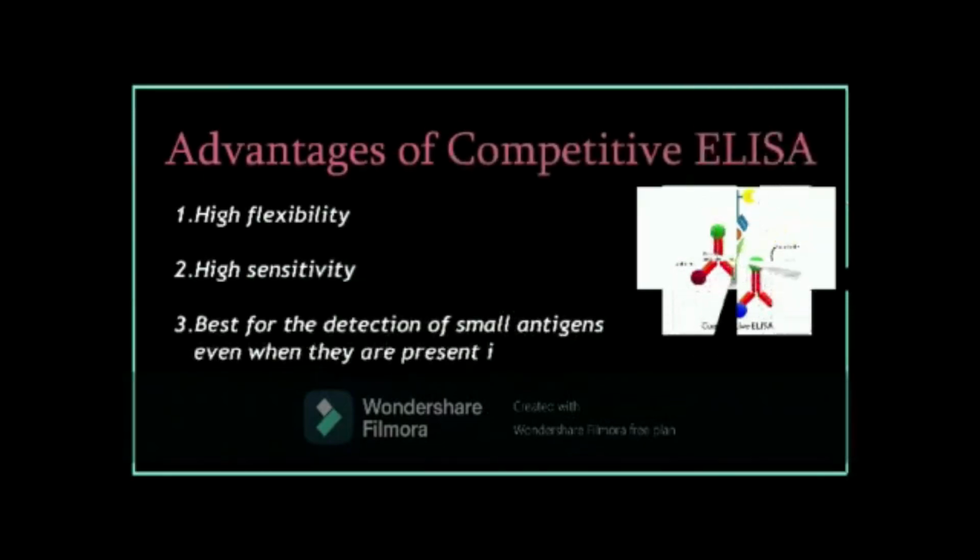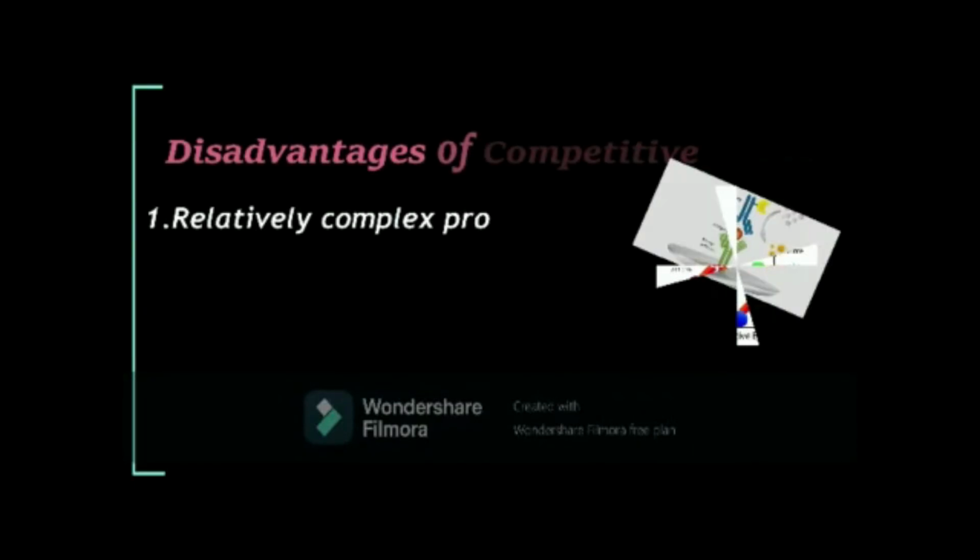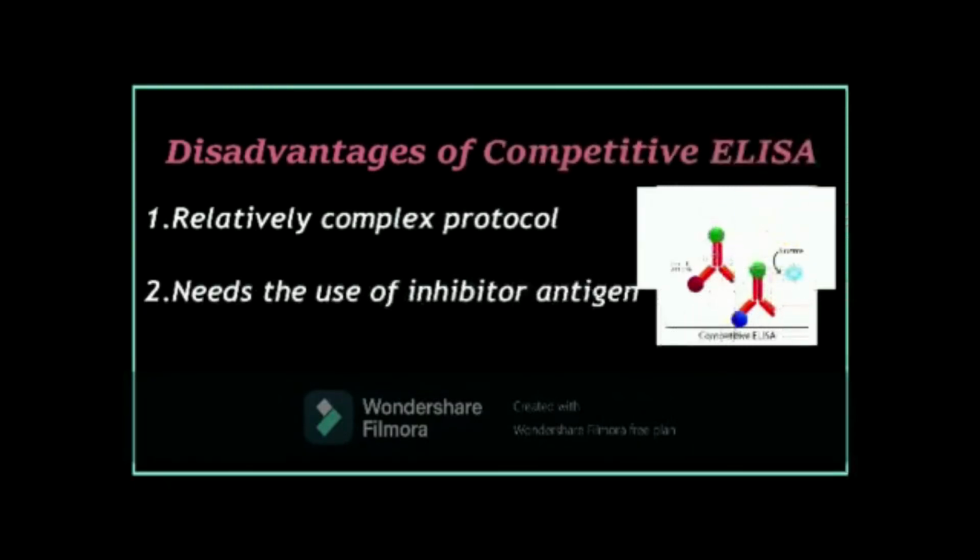Advantages of competitive ELISA: high flexibility, high sensitivity, best for detection of small antigens even when they are present in very low concentrations. Disadvantages of competitive ELISA: relatively complex protocol than others, needs the usage of inhibitor antigen.